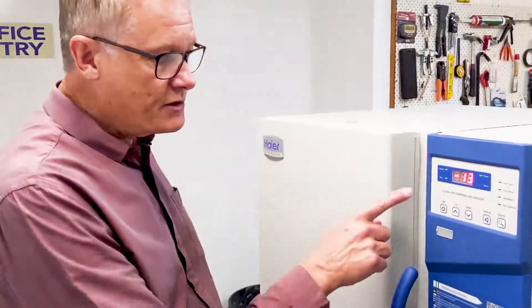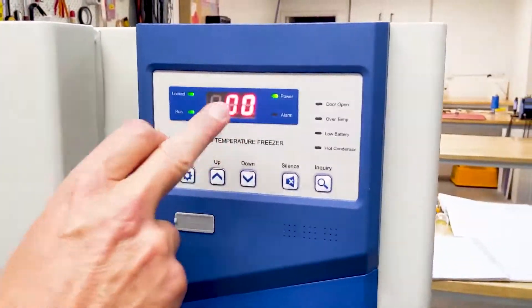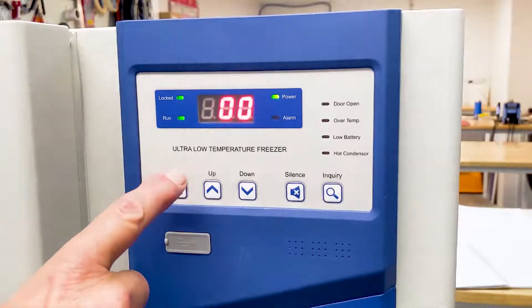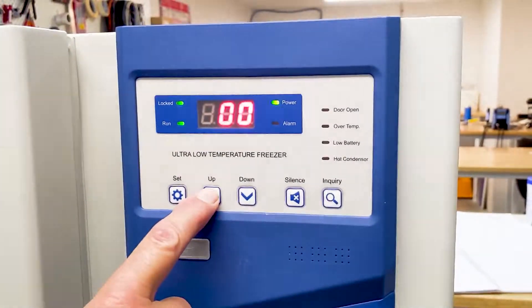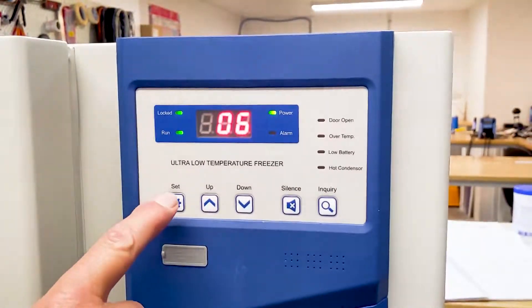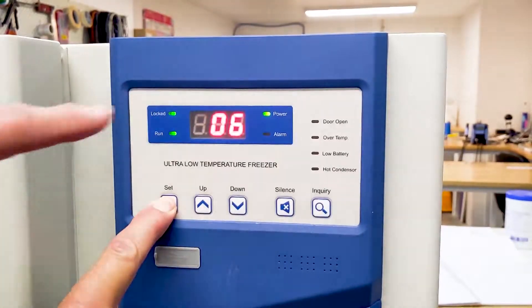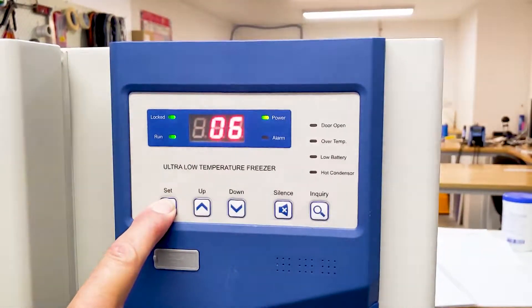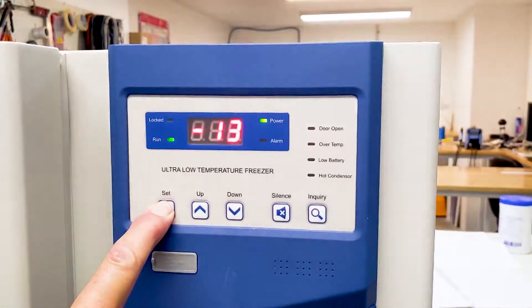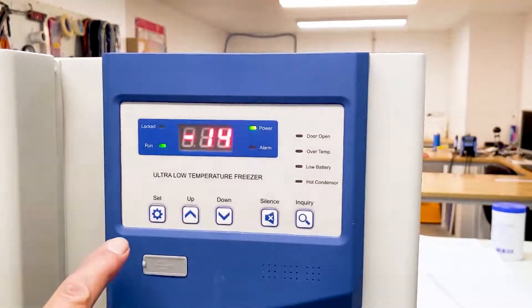To make any adjustments we first have to get it out of the locked phase and into unlocked. Go into one of the adjustment settings — in this case to unlock it's number six. So we press up to six, then hold the set button for five seconds and you'll see the locked light disappear. Like that — it's now unlocked and allows us to make any changes.